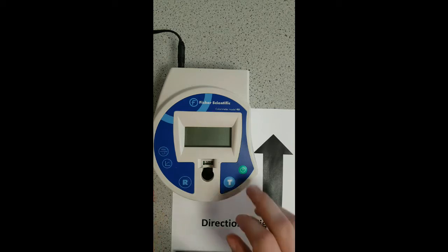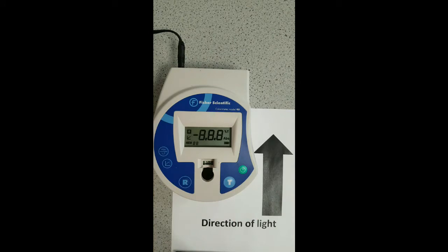This is our colorimeter here. I'm going to turn it on just to allow it to warm up before we run any samples through it. We can cycle between absorbance or transmittance by using this button here, and that's shown on the screen, or we can monitor reactions using the button below. In this video, however, we're only concerned with collecting absorbance value data.